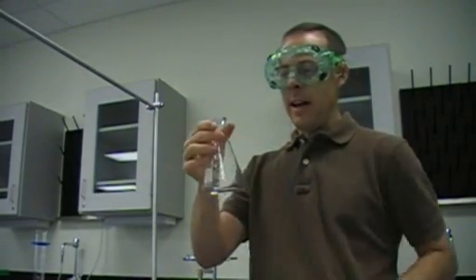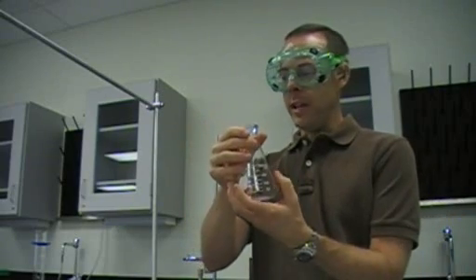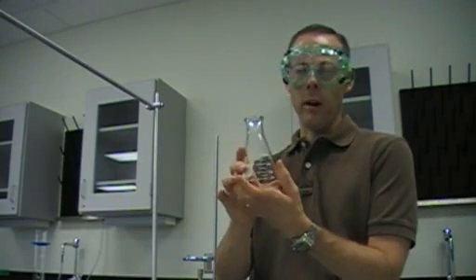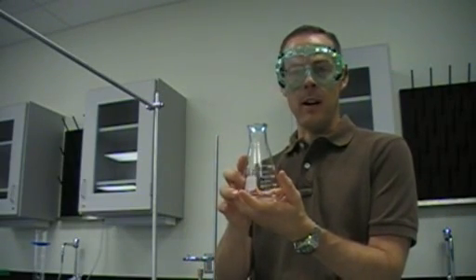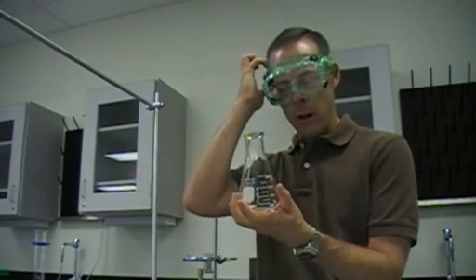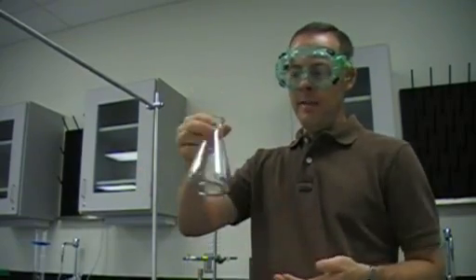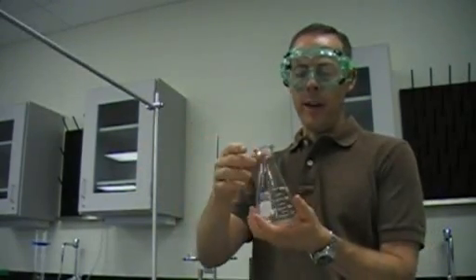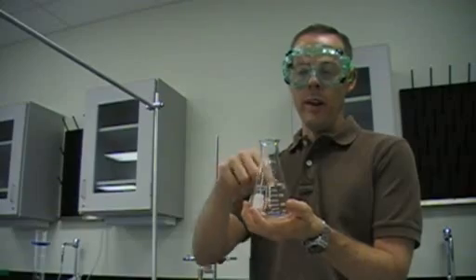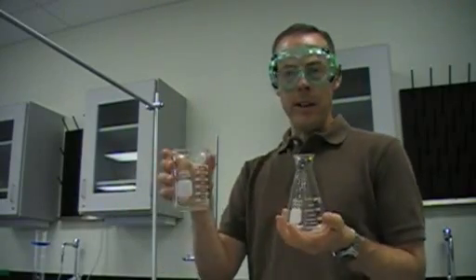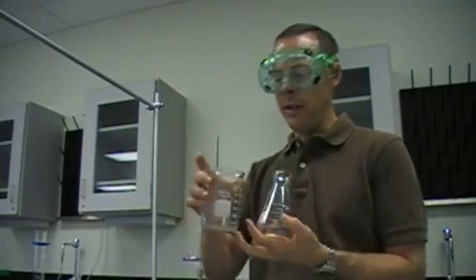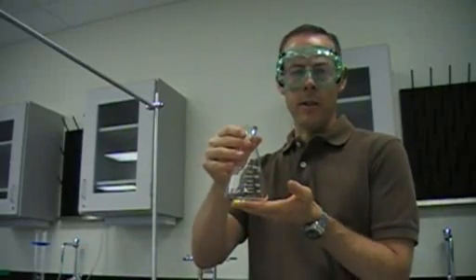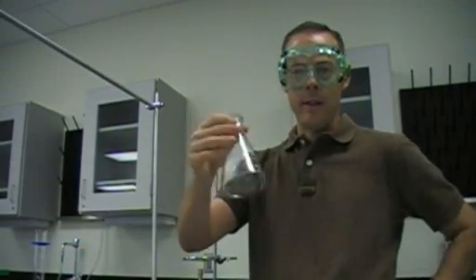What flasks are good for is if I had a liquid and I was dissolving, let's just take water. If I had water in here and I needed to dissolve some salt, just make some salt water, I could pour the salt in here and very easily I could swirl this around without a whole lot of worry about water spilling out the top. With a beaker, that's a whole lot harder to do. You'd need a stir rod, something to stir with. But if you don't have a stir rod, if you just need to dissolve something really quickly, a flask does that very easily.